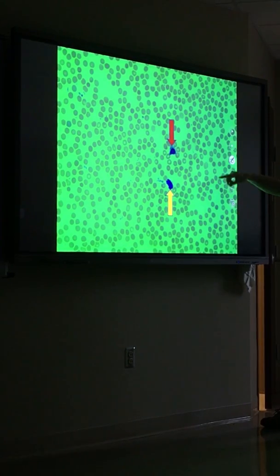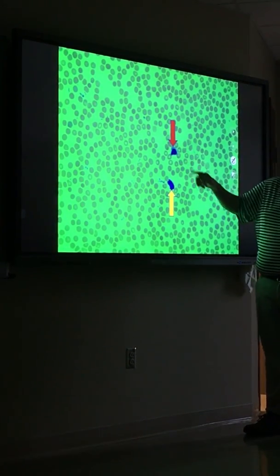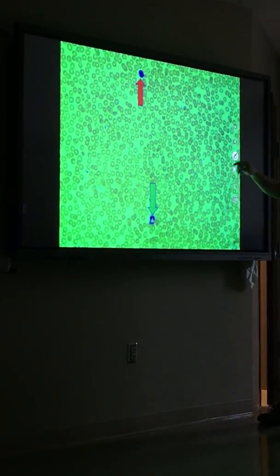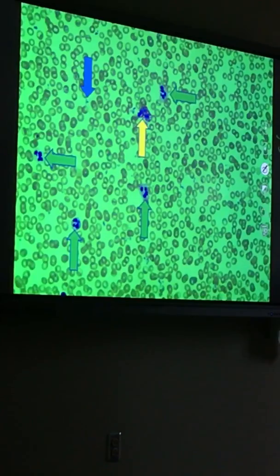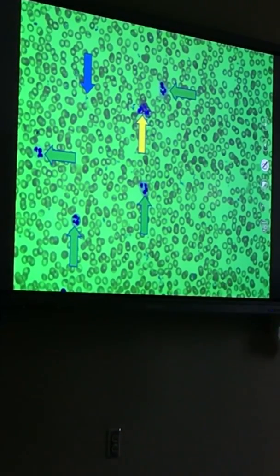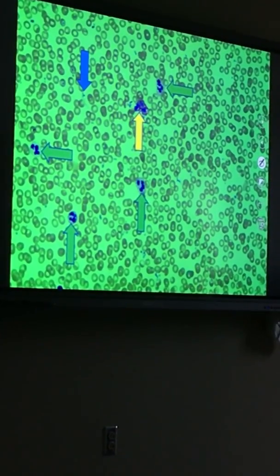Now that's a lymphocyte and a basophil. Sometimes you get a whole layer of cytoplasm around it. Lymphocyte up there and a neutrophil. And out of focus, neutrophils and lymphocytes. I'll change the colors, by the way, of the blood cells for our test, just FYI. So if you're going with arrow colors, you're going to be in trouble. And there's a busted eosinophil.